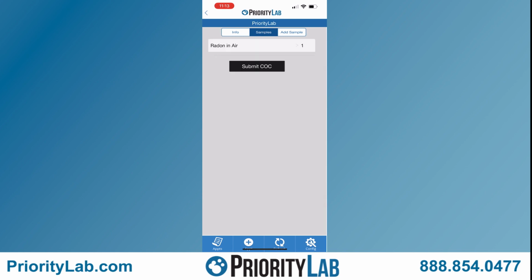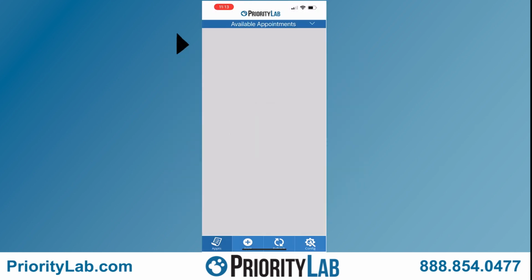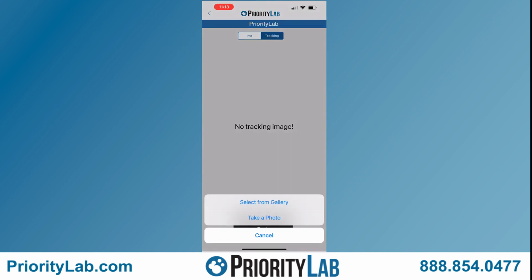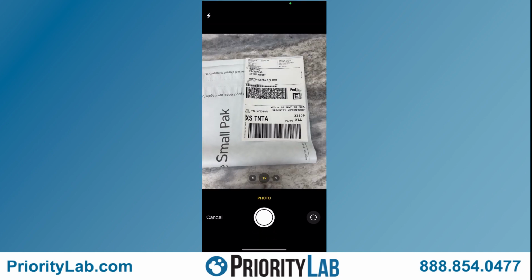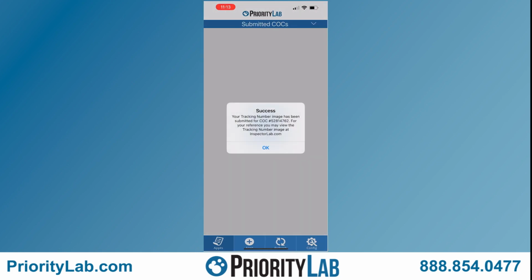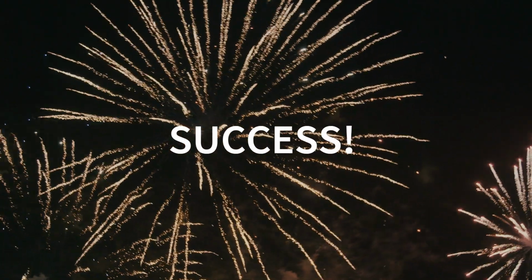Once we have submitted the COC, we will get an email indicating the lab has received our COC information. We will then upload our tracking information by going to the Submitted COC section and uploading from there. Once this has successfully been uploaded, we are done entering the Breeze LS COC.